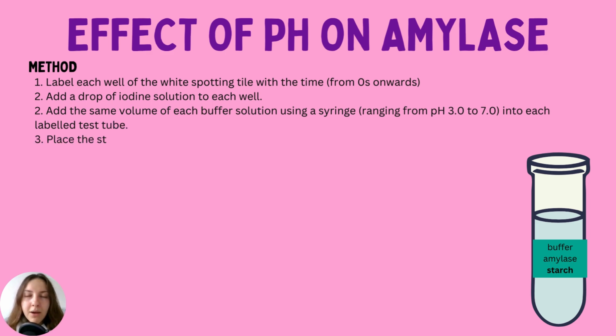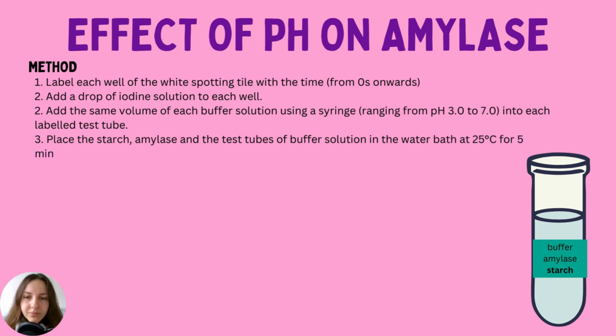Now, if you see a brown orange color sustained for a few seconds, you'll notice that that is the end of the practical for that particular pH for that particular round. That's what you're looking for. And I'll show you some examples of results in a moment.